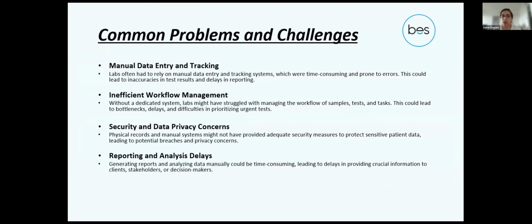In this slide, I would like to talk about the main challenges labs face when they don't have a LIMS system. One of the significant challenges labs face is relying on manual data entry and tracking systems. This process is not only time-consuming, but also highly prone to errors, which can lead to inaccuracies in test results and also delays in reporting.